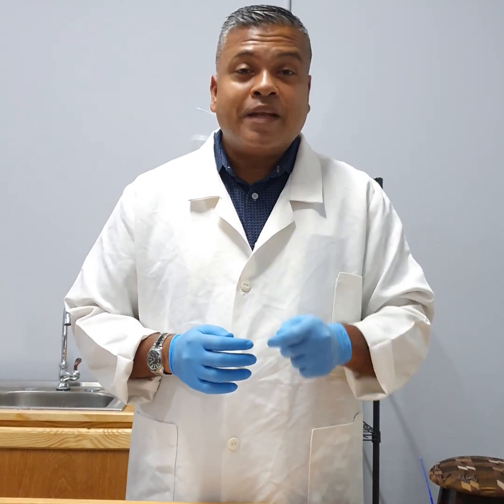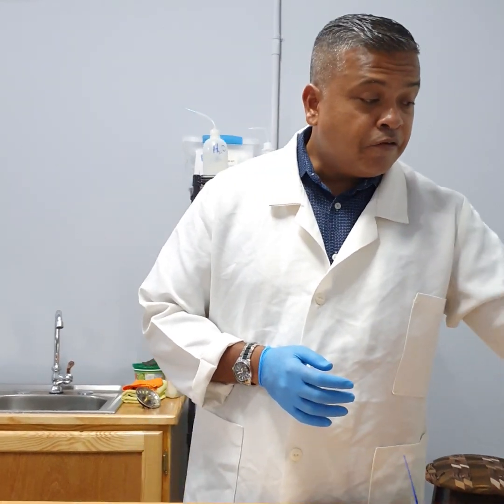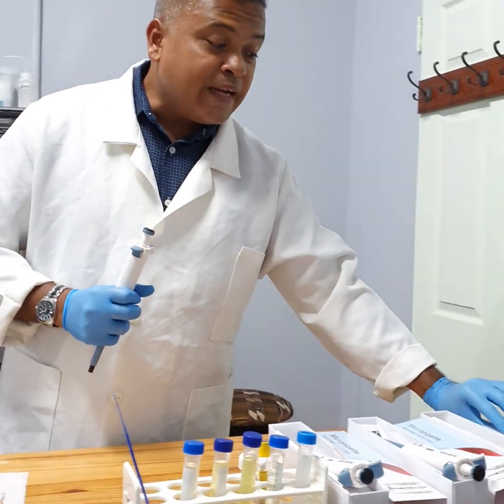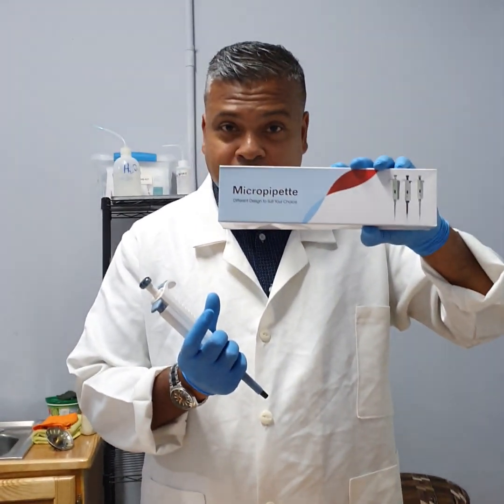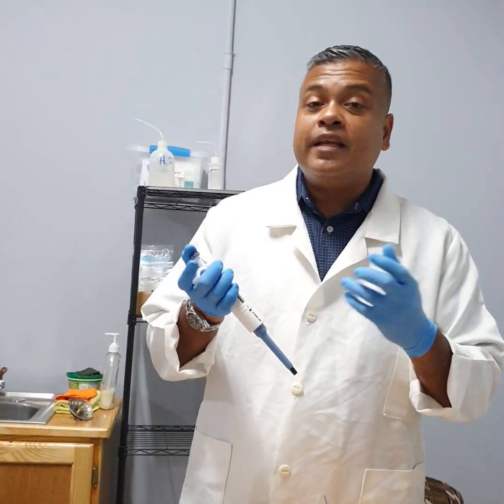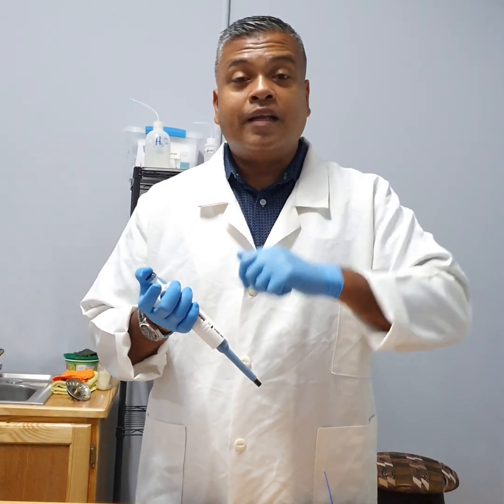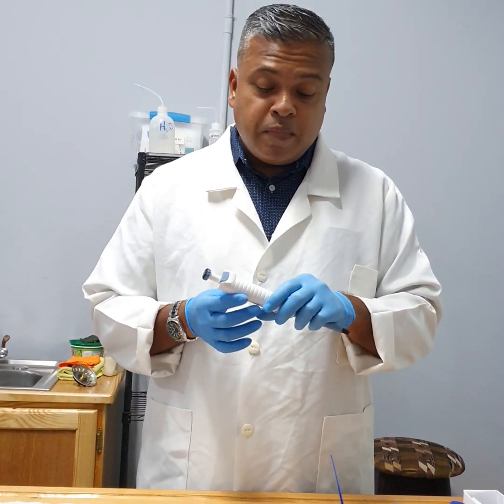All right, now with that, what do we use? We've got some very important tools in the medical laboratory, like how a mason may have his trowel, how an agriculturist may have his fork, etc. We've got in the laboratory some very important tools called micropipettes. As the name implies, they are micro, meaning small, and pipettes, meaning they do something. They aspirate and they dispense, they pick up and they release. I'm going to show you now what we mean here.